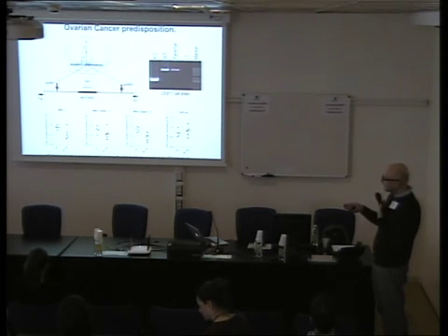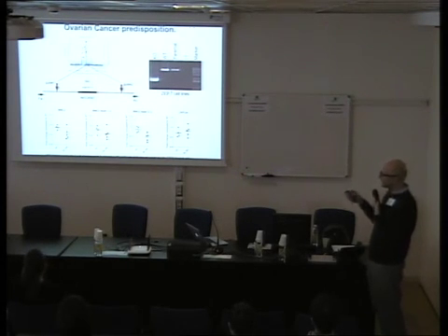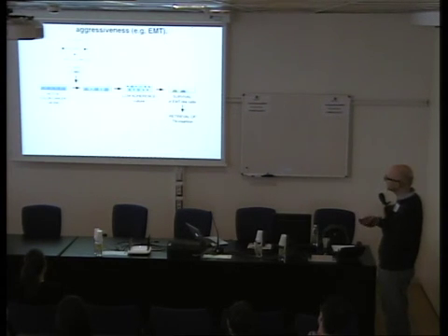And when we look in the deleted clones, the BNC2 expression in 3 different regions was lower compared to the wild type. So we associated the region where the SNP is involved as a regulator of the BNC2 expression.